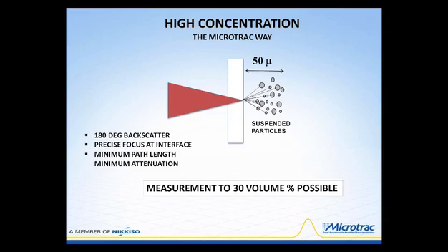If you were to use, say, a cuvette and have laser light going in and out of it at a larger angle, then you could have path lengths on the order of a centimeter, and at high concentration of sample, the attenuation of the laser beam, both the introduced laser light and the collected scattered light, gets attenuated.